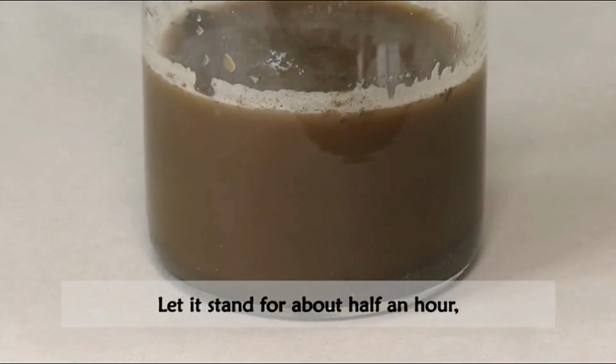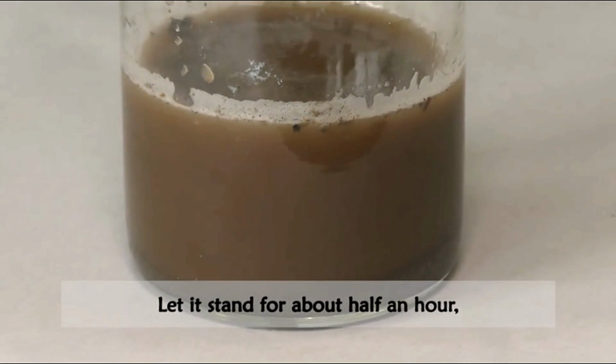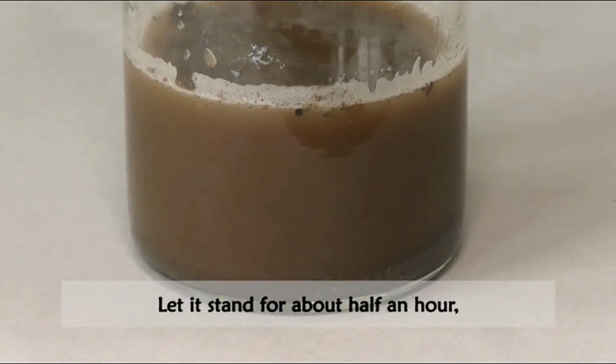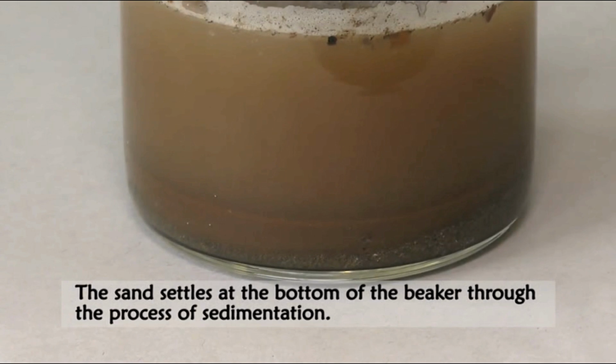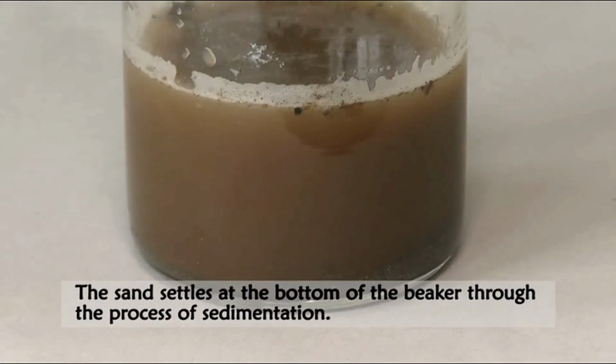Let it stand for about half an hour. The sand settles at the bottom of the beaker through the process of sedimentation.